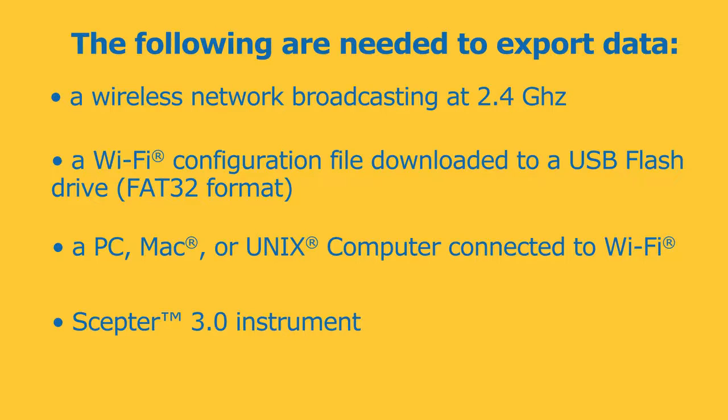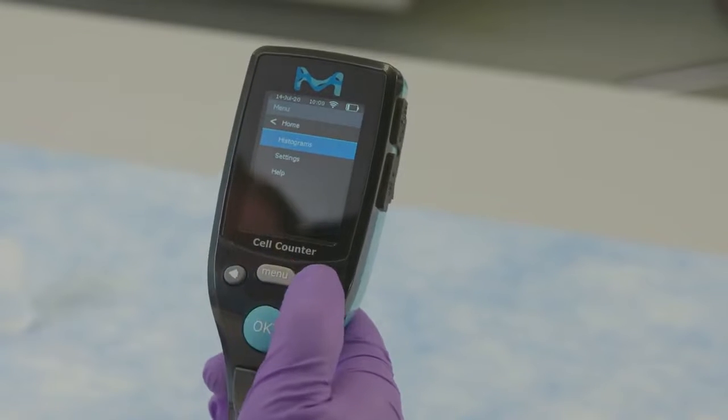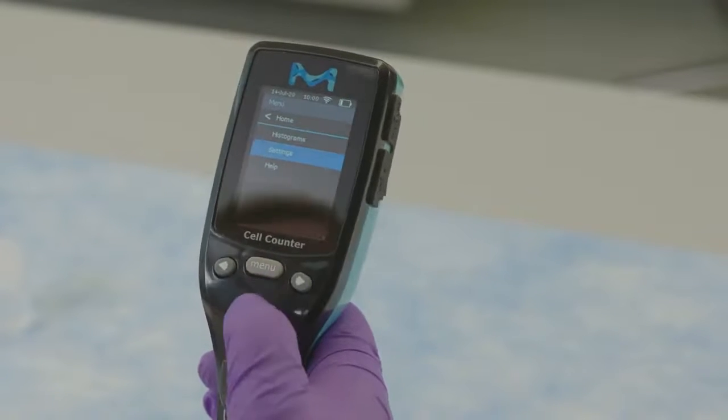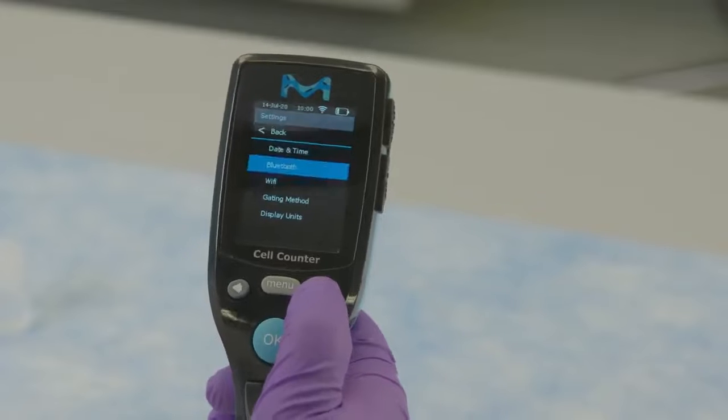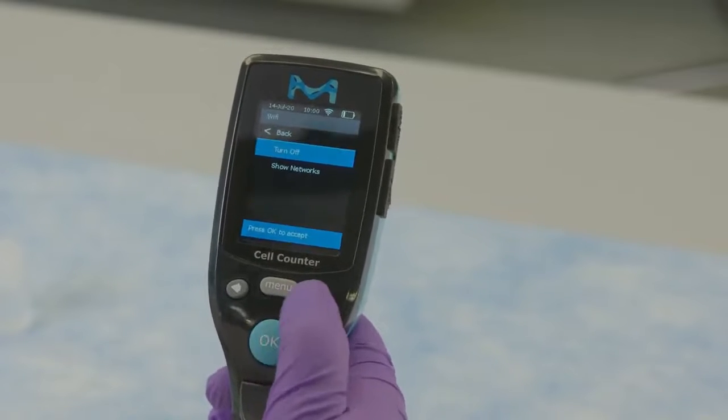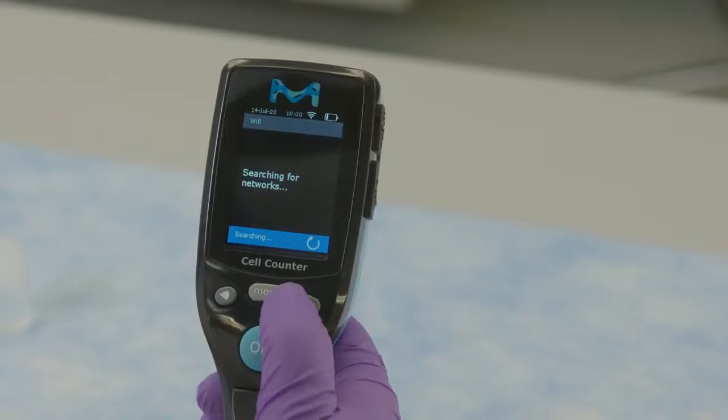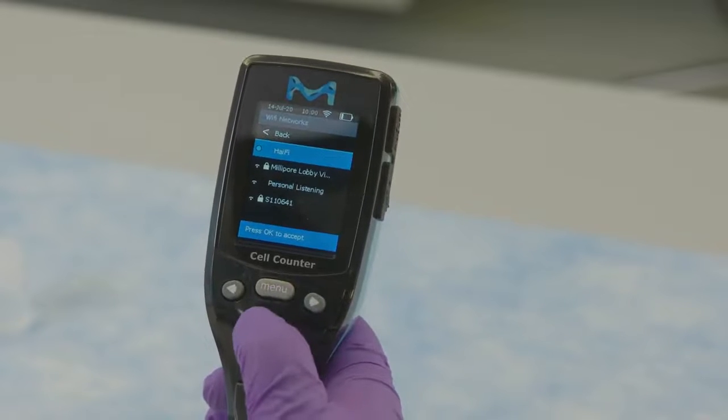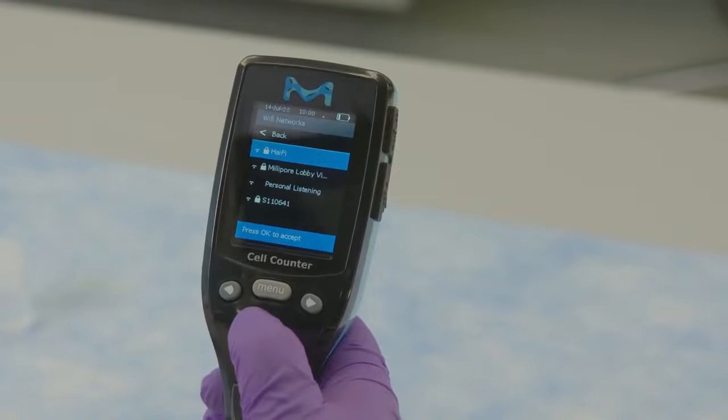To connect to the Wi-Fi network, turn on your Wi-Fi. From the main menu, select settings and press the OK button. Select Wi-Fi and press the OK button. Press the OK button and it will begin searching for networks. The display will list available networks within range. Scroll to desired network and press the OK button.